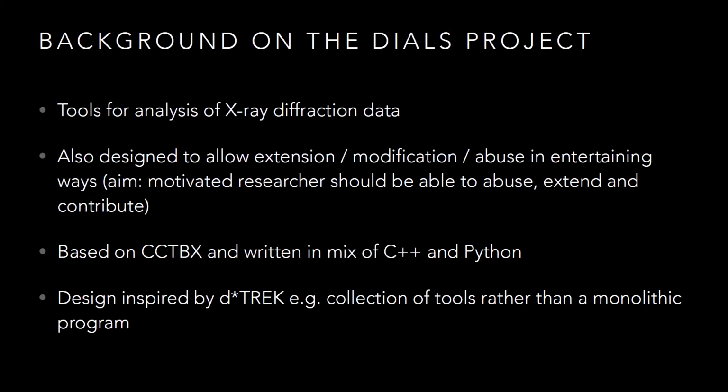Okay, so what am I talking about here? The idea with DIALS is we wanted to write some new software for doing single crystal X-ray diffraction data processing. We didn't want to write a black box like XDS, like MOSFLM and so forth, because everybody who was involved at the beginning of DIALS was frustrated by black boxes. So what we wanted was to put together some software which would allow everybody to get their data processing done, but also allow people like the people in this room to use and abuse the software in entertaining ways. Or if you're a scientist and you want to develop some new algorithms, or you've got a postdoc who's looking bored and you want to make them do something, you can send them off on their merry way and they can contribute to the software.